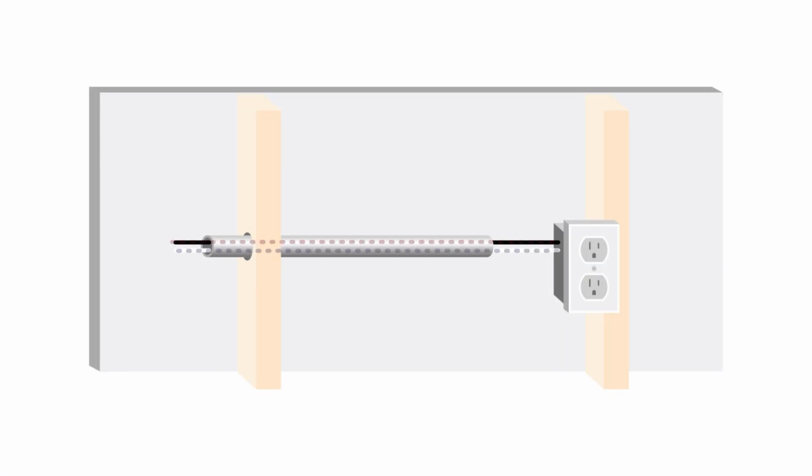For these types of installations, AC magnetic fields in the wiring of the rooms is not that problematic, particularly if there's care taken for which type of conduit to run the wiring in. That's because to do the wiring to code, you're going to have a balance between positive and negative, and so you don't have the net current issue that you have in older type buildings.